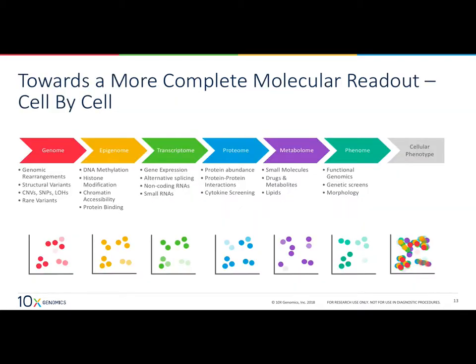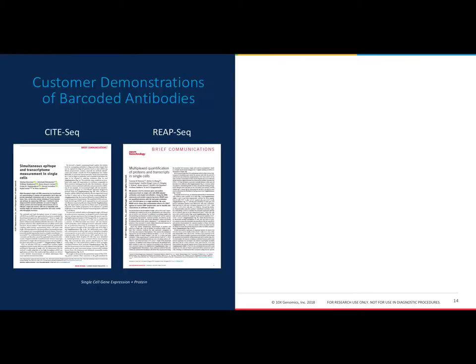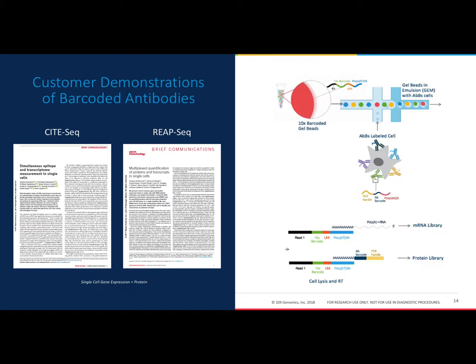And then the second thing that you've probably heard about by now, but we are also releasing, is looking at a few different of these little colored boxes here, but specifically with respect to the proteome and the transcriptome at the same time. We're building off a paper, or 2 papers that came out, CITE-seq and REAP-seq. These came out end of last year around the same time. CITE-seq from New York Genome Center and REAP-seq from Merck. Essentially what they're doing here is they're creating a synthetic mRNA that they attach to an antibody, and give that synthetic mRNA a barcode that can then be tied back to that specific antibody.